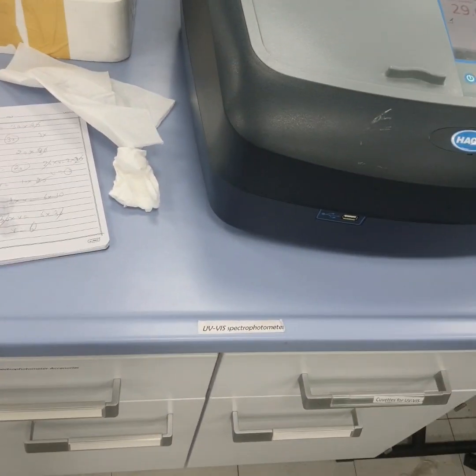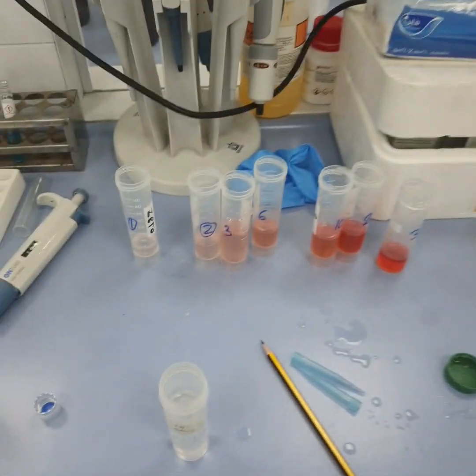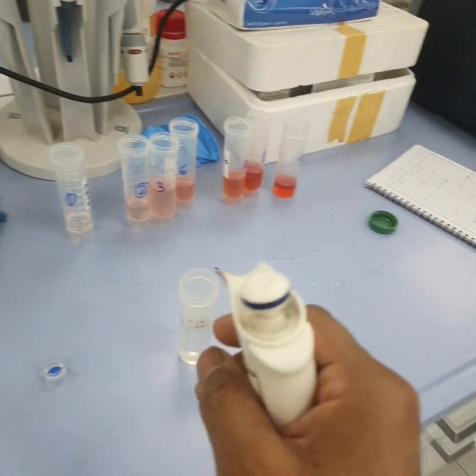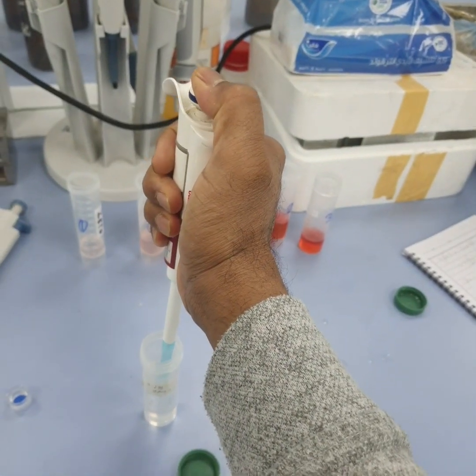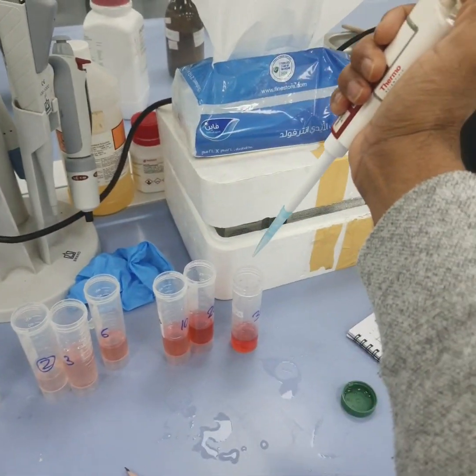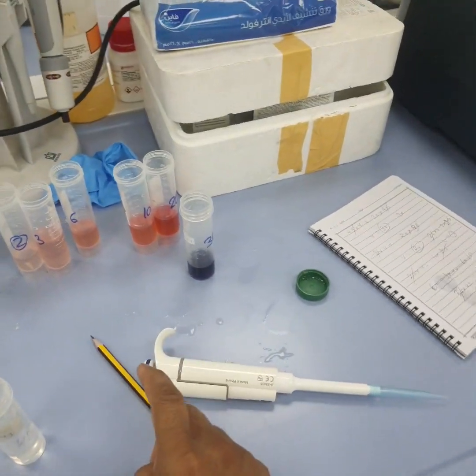One thing more I forgot to explain. See, this is my acid, right? Usually working with the Congo Red dye, it is not okay to go below 5. When you go below 5, what happens? This dye precipitates. You see, this is my 0.1 normal HNO3. When I am adding this, see what happens here. You see now the color change. So it's not okay to work in the highly acidic range.